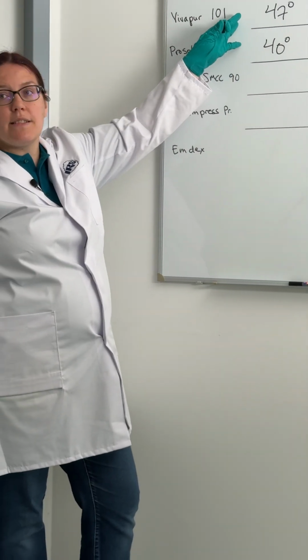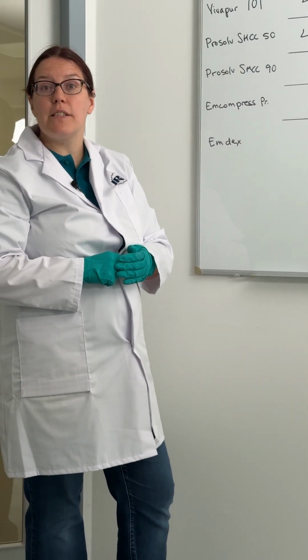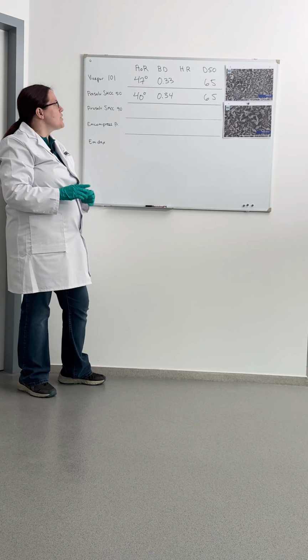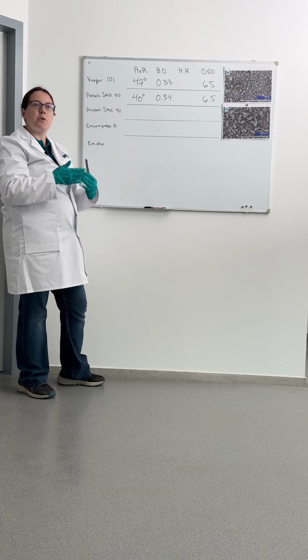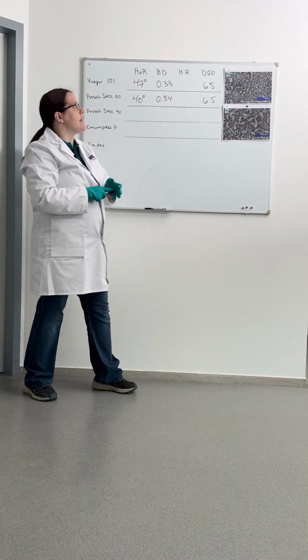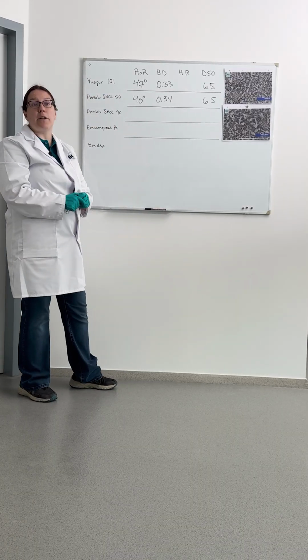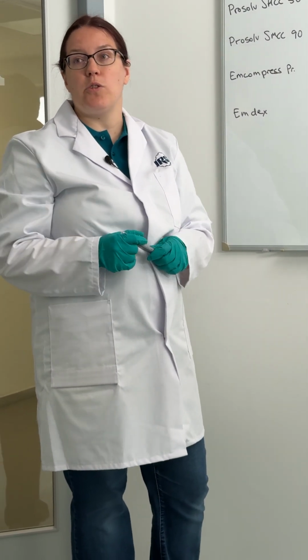So for MCC, a small particle size MCC, we got a poor angle of repose of 47 degrees, whereas with silicification, we got a much better angle of repose, although still in the passable range. So here, the primary difference is silicification, which can actually act to reduce the friction between particles. So as these fibers try and move past each other while they're flowing, they can kind of stick to each other more with the MCC, but with silicification, they kind of slide past each other more easily, leading to better flowability.